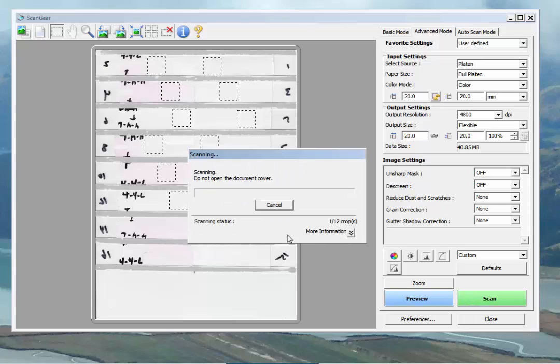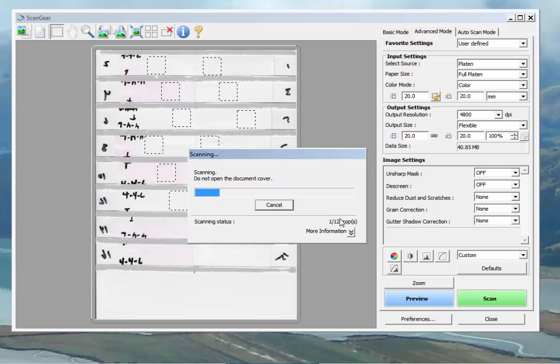And now we've got a lot of time. So what's going to happen is this will scan as an entire batch. So at this point, you know, at about two minutes of scan, one and a half to two minutes per scan, you've got some time. And so once you've got the first batch done, then you can go back and begin analyzing with ImageJ while the scanner was scanning the next batch. But you'll have a little bit of a lag. And so we'll be back in a few minutes once this is all done. And we'll pick up with where to go from here.